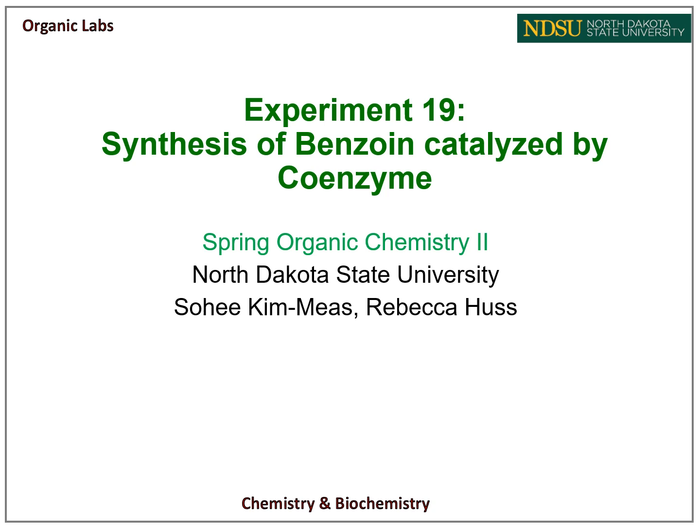Hello, I will be talking about the synthesis of benzoin catalyzed by a coenzyme in this video. You can watch this video with the Pavia Lab Manual, page 97.